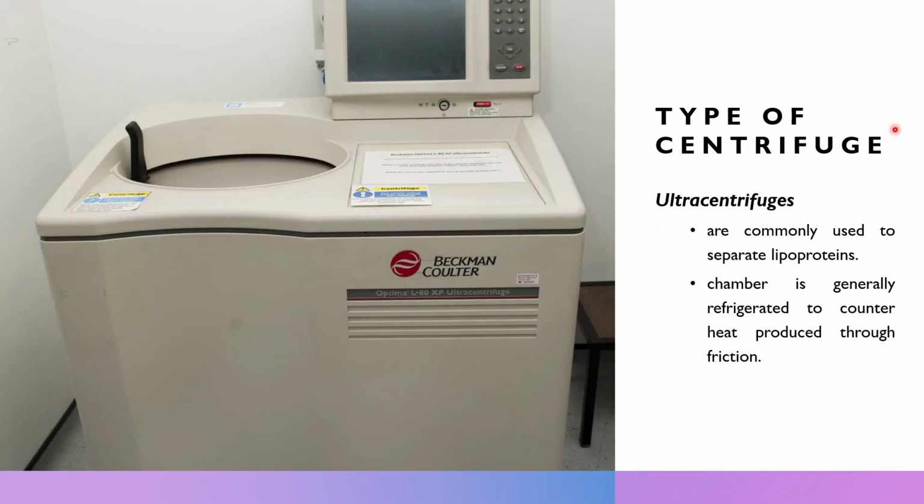There are also ultracentrifuges. These are commonly used to separate lipoproteins. The chamber is generally refrigerated to counter the heat produced through friction. They are called ultracentrifuges.